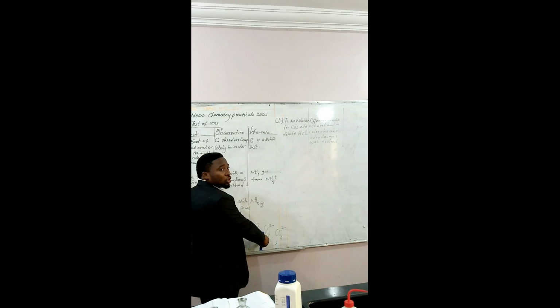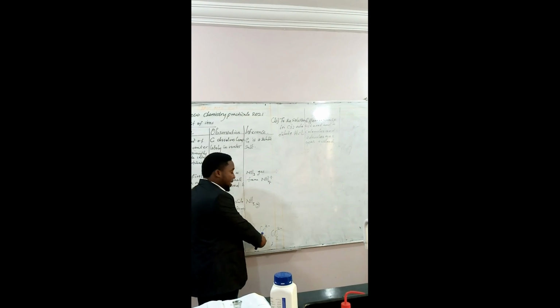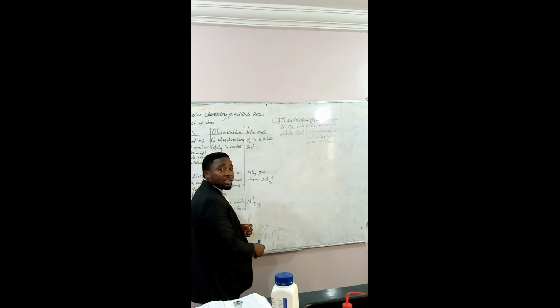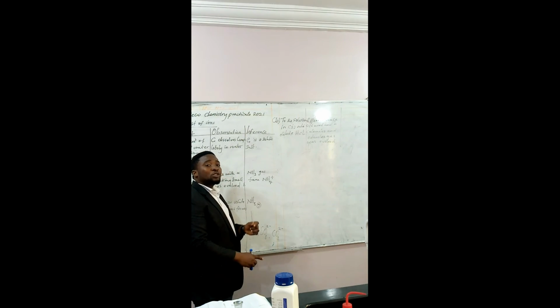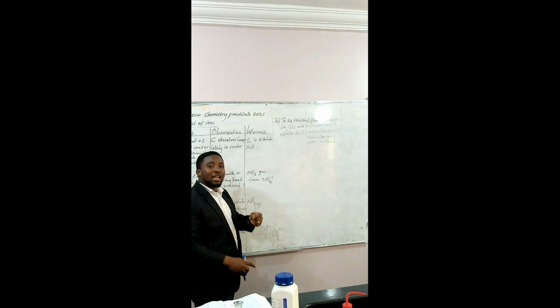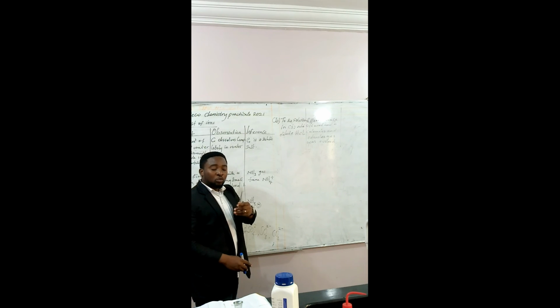So we are going to make our judgment using these two ions, which are sulfite ion and carbonate ion. Now, the two of them will produce two different gases. If sulfite is the one present, it's going to give us a gas that smells like burning matches, and that is sulfur dioxide. But that wasn't what we observed.